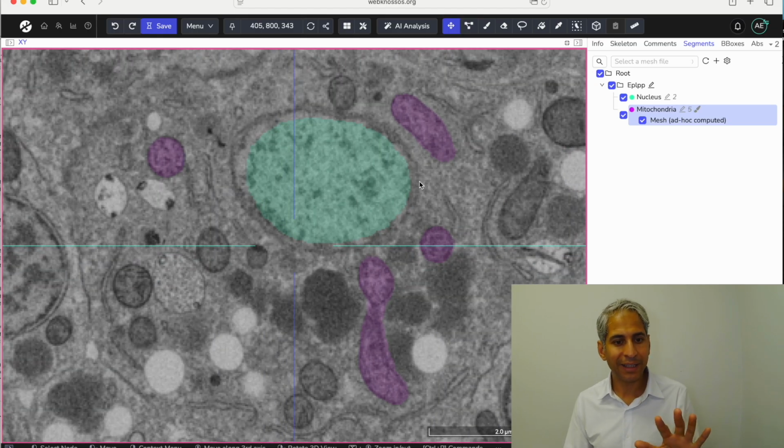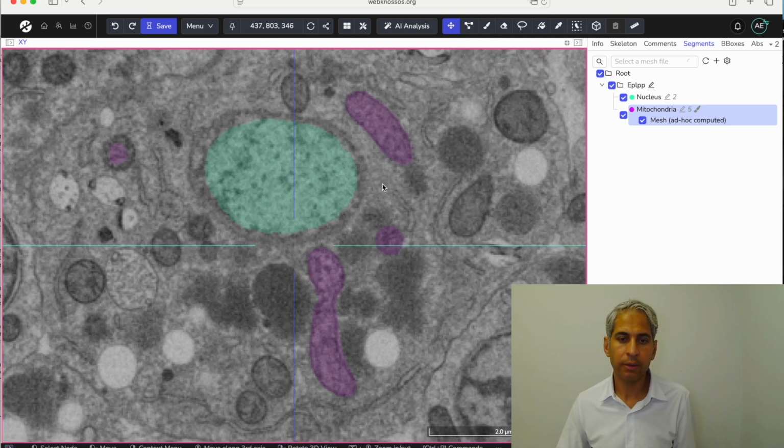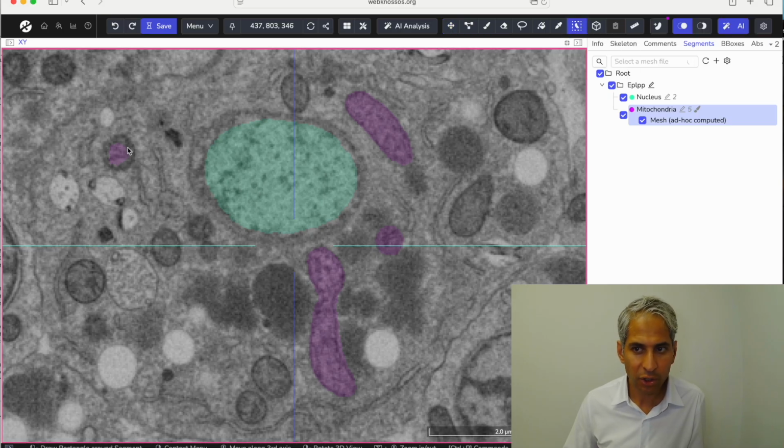This week, annotate 10 mitochondria. That's enough. And if you have fewer than 10 mitochondria, then this is an easy week for you. But remember, quality over quantity. While I'm at it, and while I just said that, let's make sure we fill in this gap. Okay.